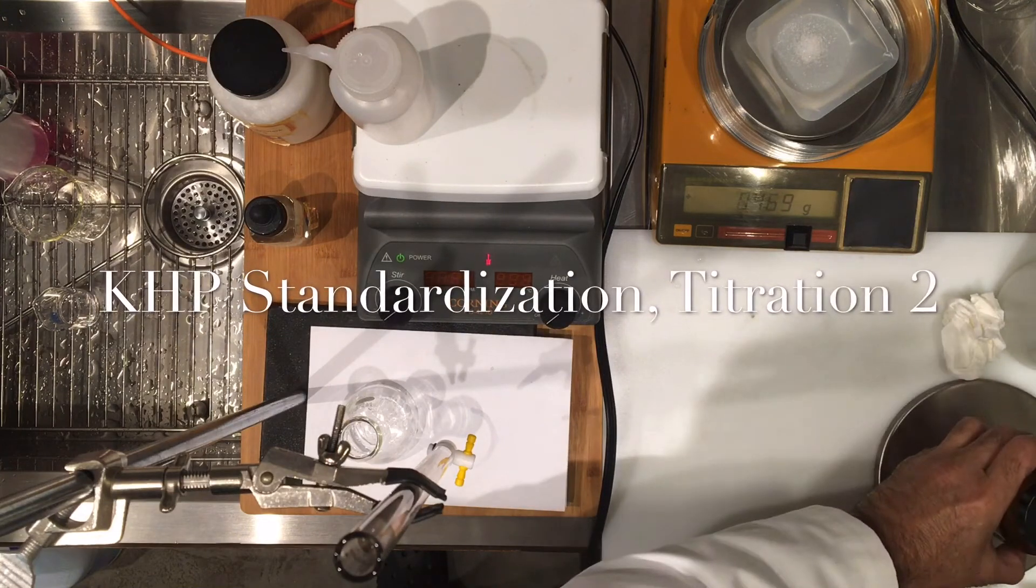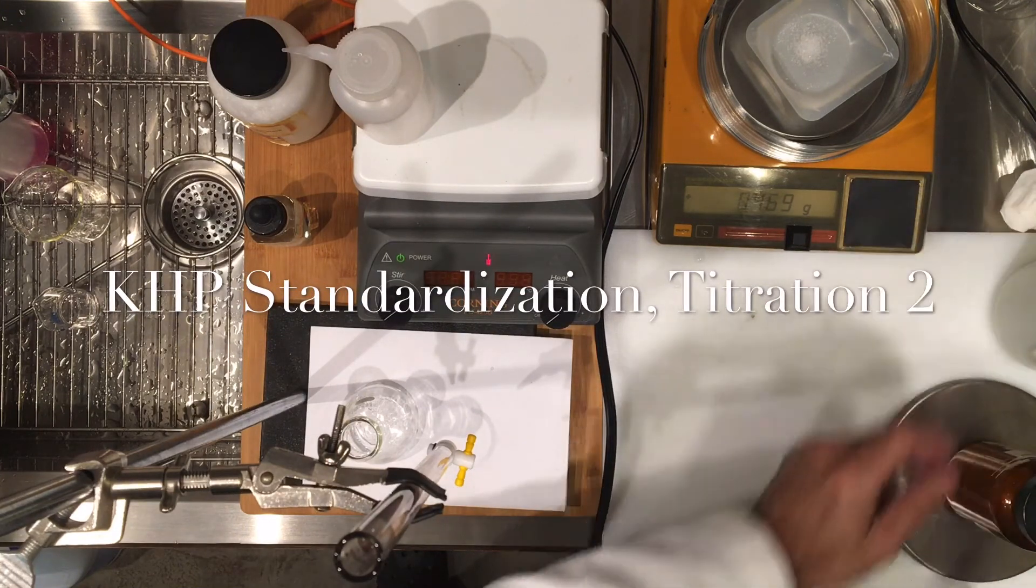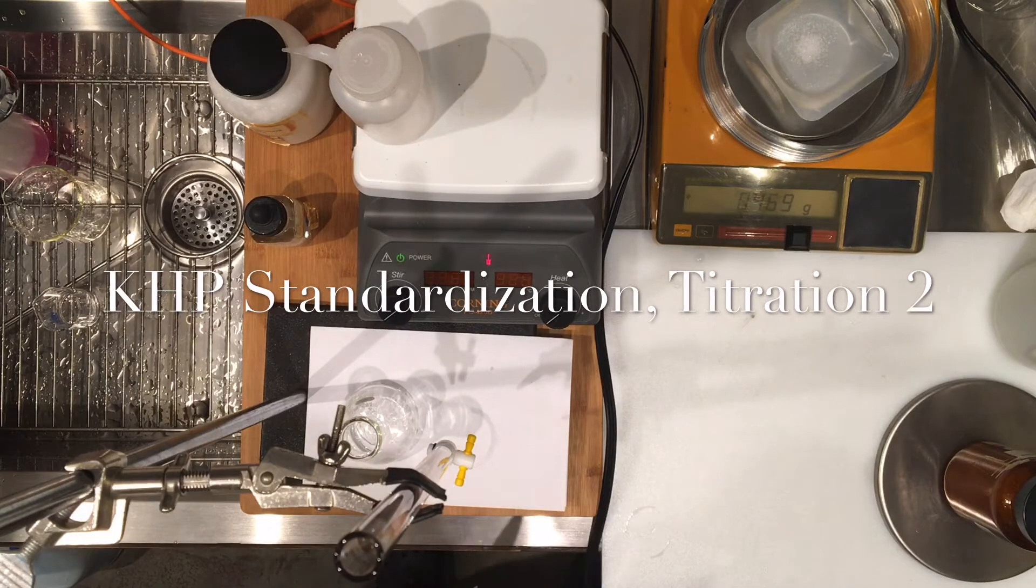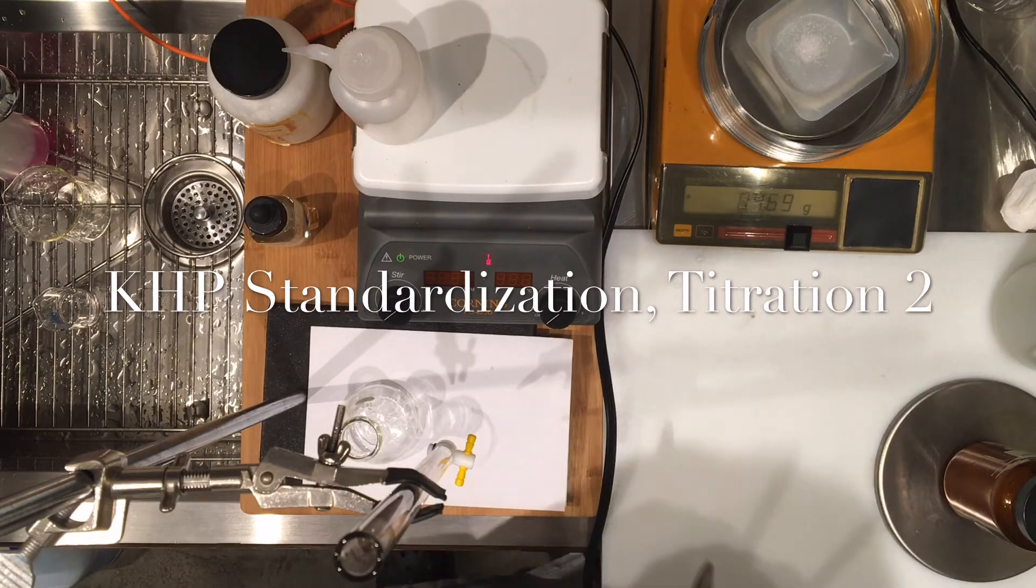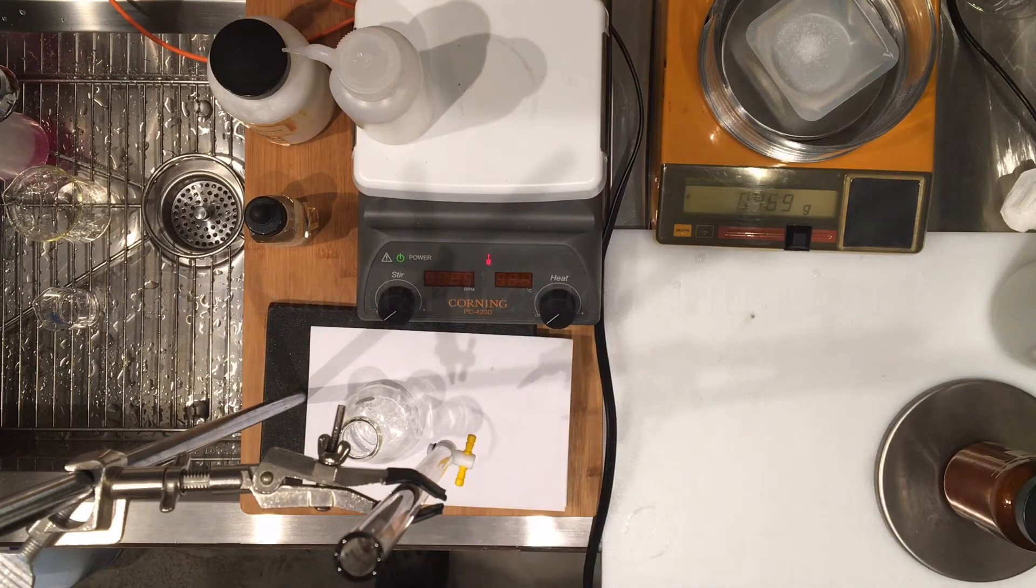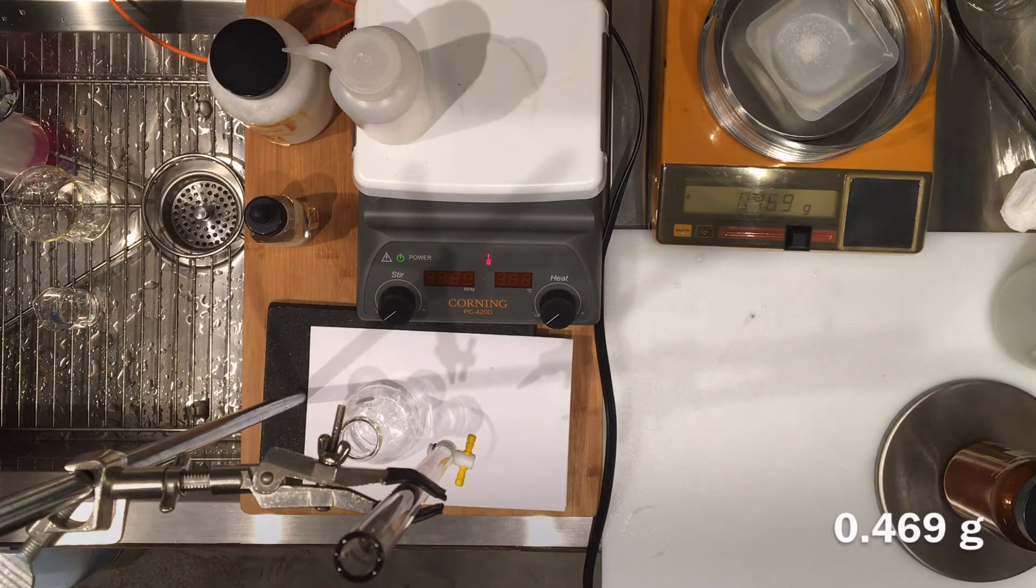Titration number two of standardization of sodium hydroxide using KHP. Here's the mass of KHP, please record that: 0.469 grams of KHP. This is for my trial two, so write that into your lab notebooks.